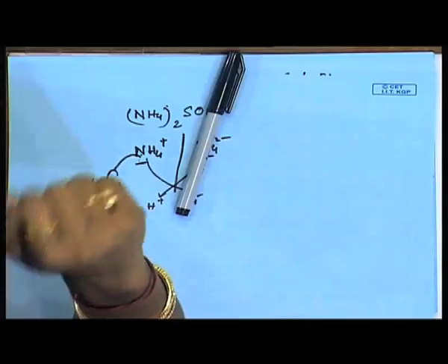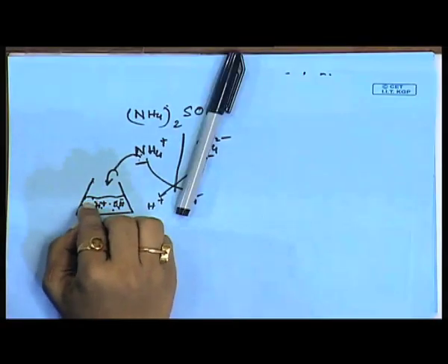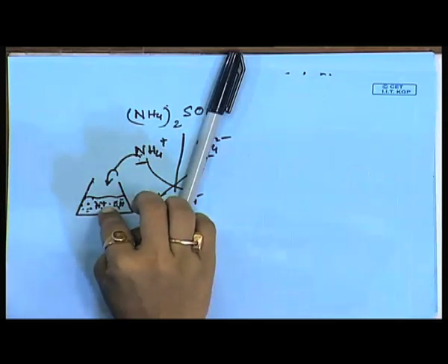Here, in case of hydrophobic interaction chromatography, the scientists are using the same principle. Now, here what we are doing? We are using some salt. We have learned that ammonium sulfate increases the hydrophobicity of that particular environment. So, the more hydrophobic the environment, the stronger the binding.